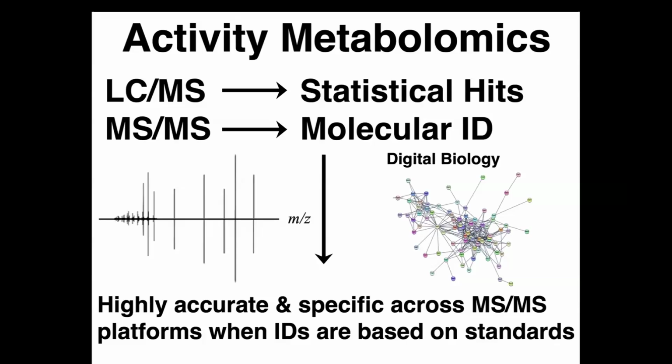This is because the annotation technologies for genes, transcripts and also proteins is extremely good, and it's capable of creating these highly accurate plot networks that Cytoscape allows us to create.